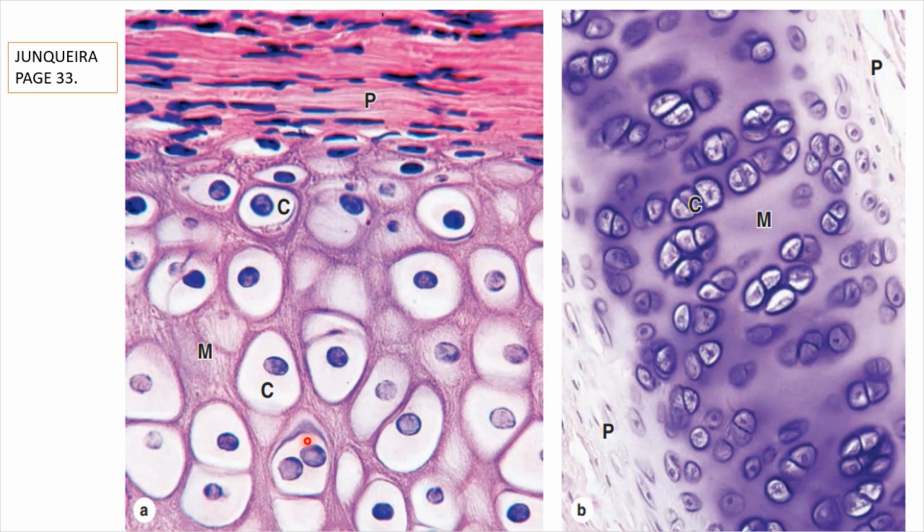The hyaline cartilage has got collagen fibers, and this is the lacunae. The lacunae has got cells here called chondrocytes. So as you can see, the chondrocytes on the middle layer here are aggregated, or they are paired. The chondrocytes here are paired, and this pair is what we call a chondron. Chondrocytes are paired in the lacunae, and the pair is known as a chondron.